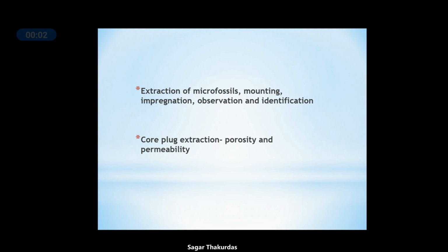Then comes extraction of microfossils from these samples by crushing these samples or by carrying out the sieve analysis. And once these microfossils, which are very small in size, are separated from the parent rock, these microfossils are mounted on a slide, impregnated so that they don't break, and then observed and identified under the microscope.